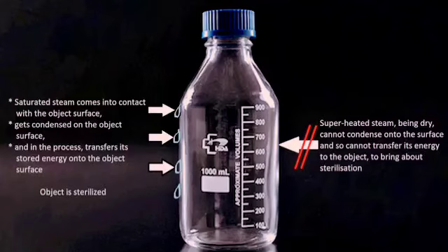Even though the amount of energy stored in dry or superheated steam is higher than that which is stored in wet or saturated steam, the energy of superheated steam is virtually useless when it comes to effective sterilization, because it, being dry steam, does not contain the required moisture and therefore cannot condense on the object surface to transfer its energy for bringing about sterilization. For this very reason, saturated steam is a much more effective sterilizer than superheated steam.